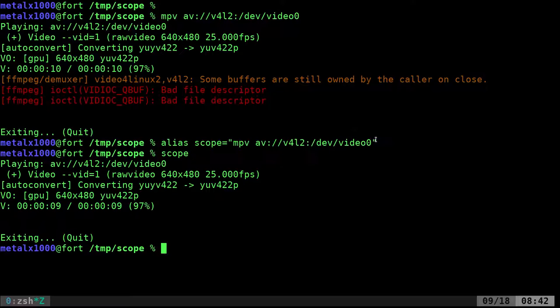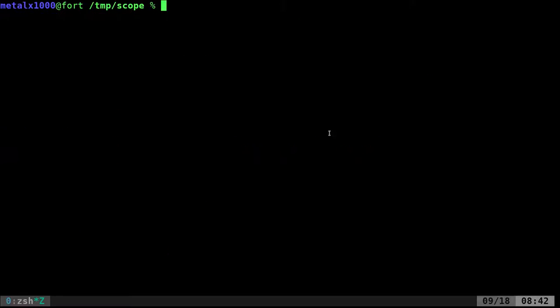All you have to do is take this line, alias scope or whatever you want to call it, and put it in your RC file. For bash it's .bashrc, for z shell it's .zshrc, or both could use .bash or .zshrc.local depending on how your system is set up. I took it a step further for Ember though.